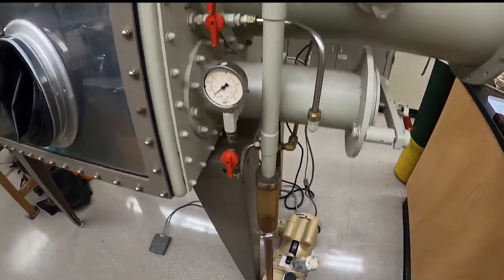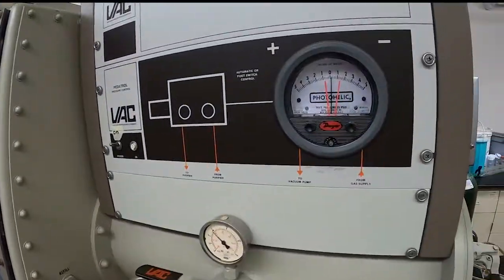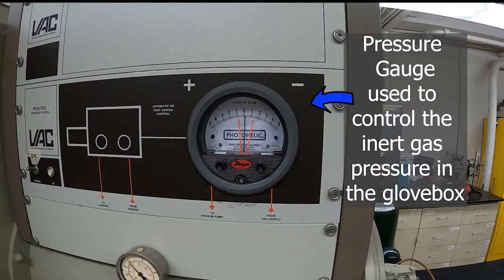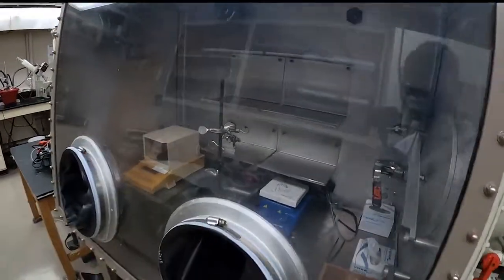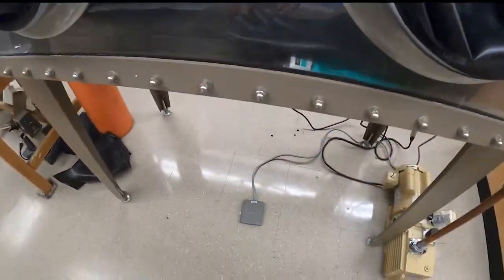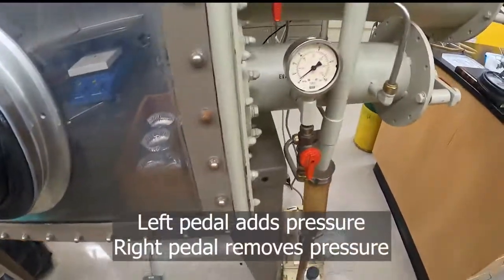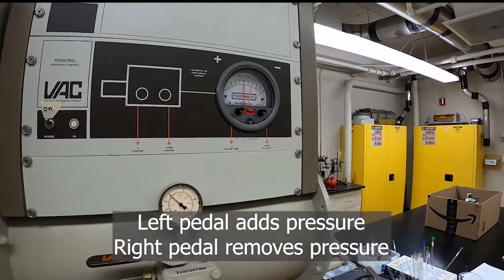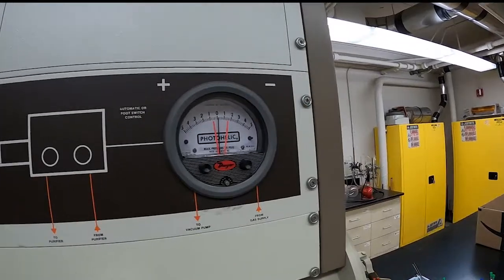This is the pressure gauge for the glove box. This is for the atmosphere inside the glove box. Here are the gloves, and this is a foot pedal to control the pressure — the right side increases the pressure and the left side decreases the pressure.